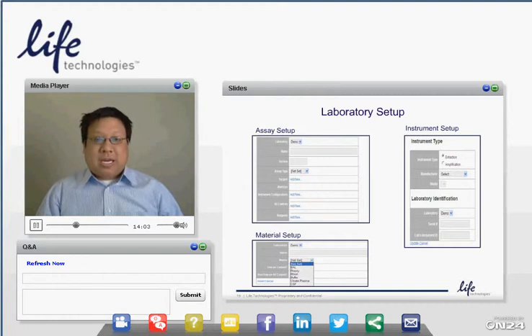When you set up an assay, you can name your assay and identify the number of targets, so you can create a multiplex assay with this software. What controls and reagents are required with the assay? When you set up the instrument, you set up whether it's an extraction instrument or an amplification instrument, what the manufacturer is, and what the serial number is. These are all identifiers that, when you call upon them, you validate and check the calibration verification on these instruments and assays.